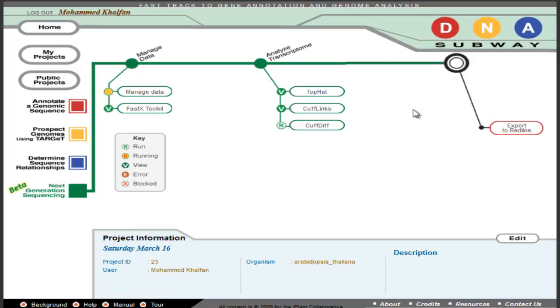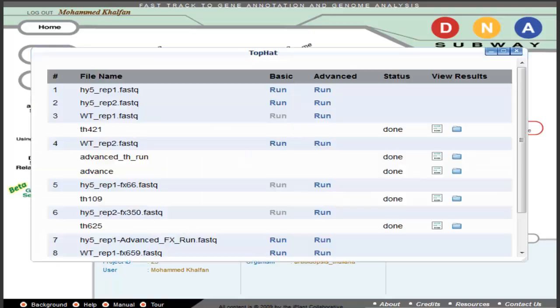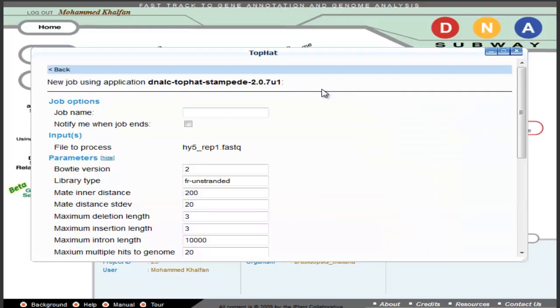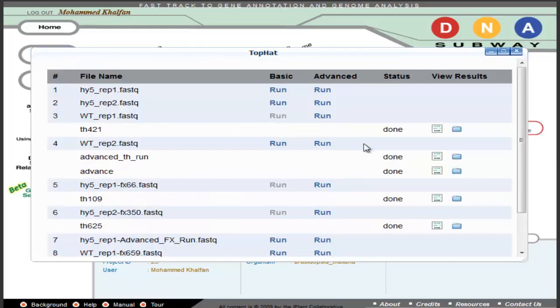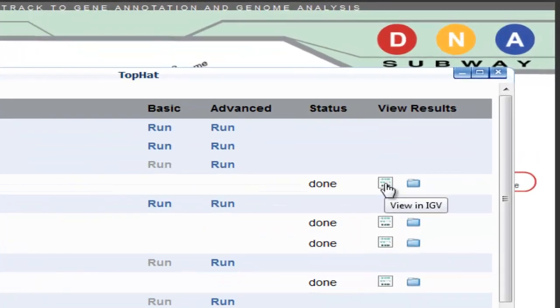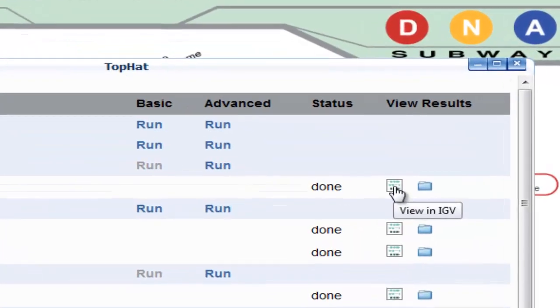At these various stops, as shown previously, you'll be able to run using either basic defaults or customized advanced parameters. Then, you can either download the results or in some cases view the reads using IGV Viewer.